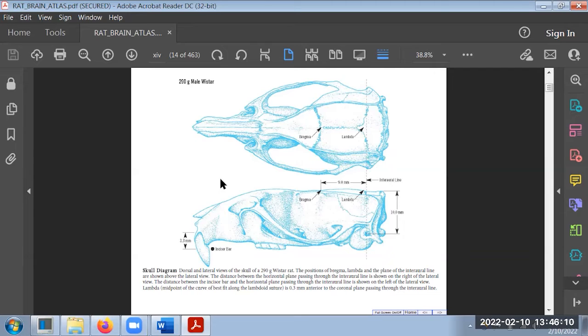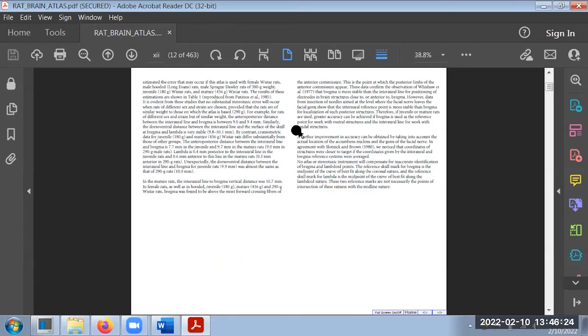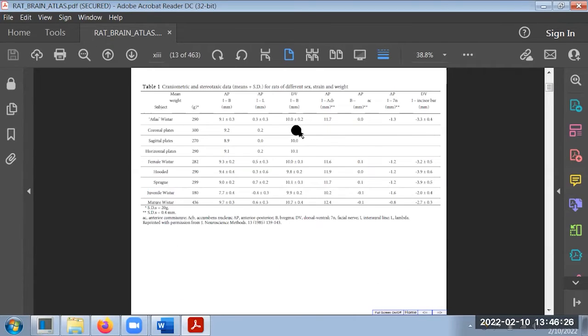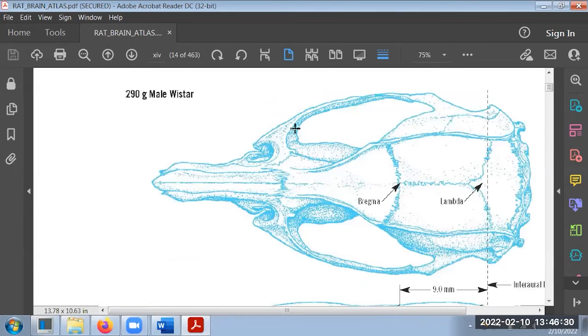When we expose the skull surgically, we don't have to take off all the skin, thankfully. We just take off enough to see what we need to see and also over the target of our interest. When we look at the top of the skull, shown in the upper part of this figure, we see these weird squiggly things crossing over.